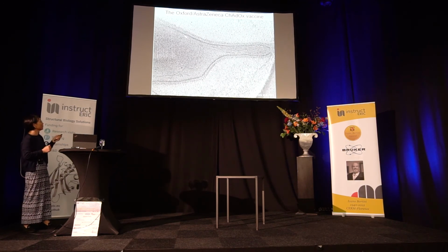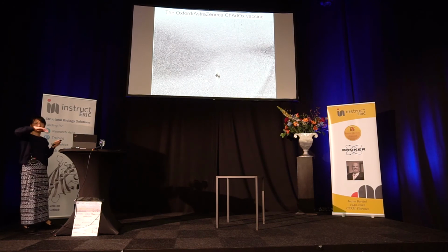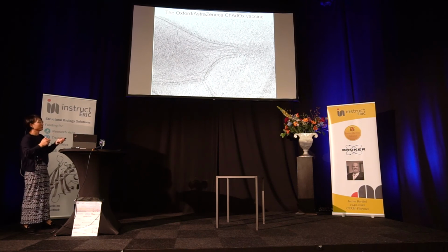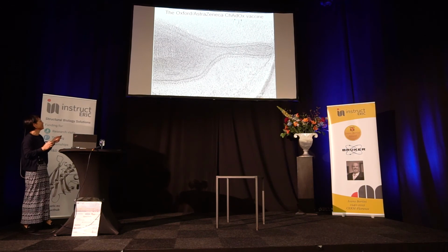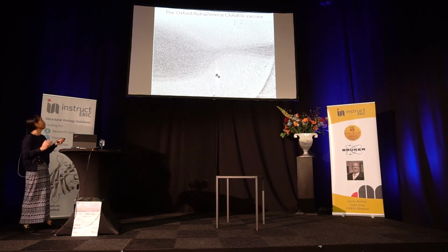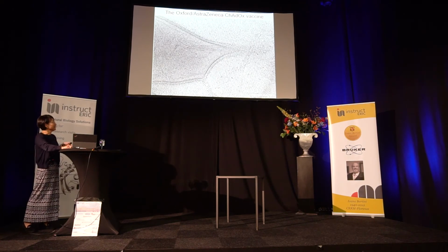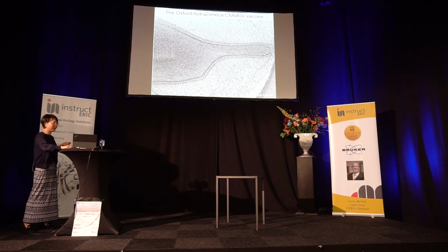They almost look like hedgerows in the UK countryside, between the farms. You see rows of hedges very, very evenly distributed and entirely covering the cell surface. Amazing. And you see mostly pre-fusion spikes, no post-fusion spikes, which is really good news to us. We take those spikes again to cryo-ET subtomogram averaging.